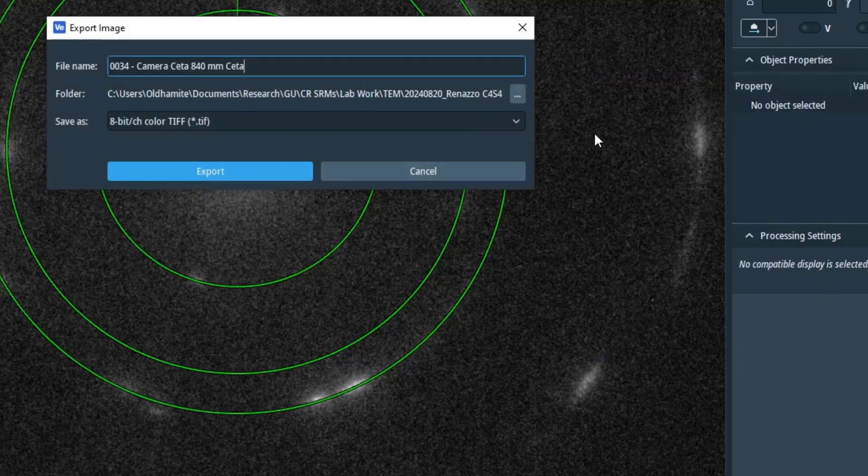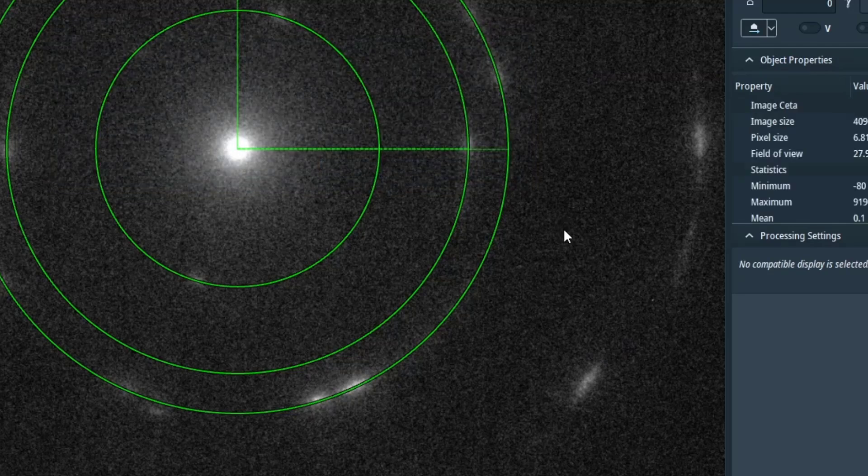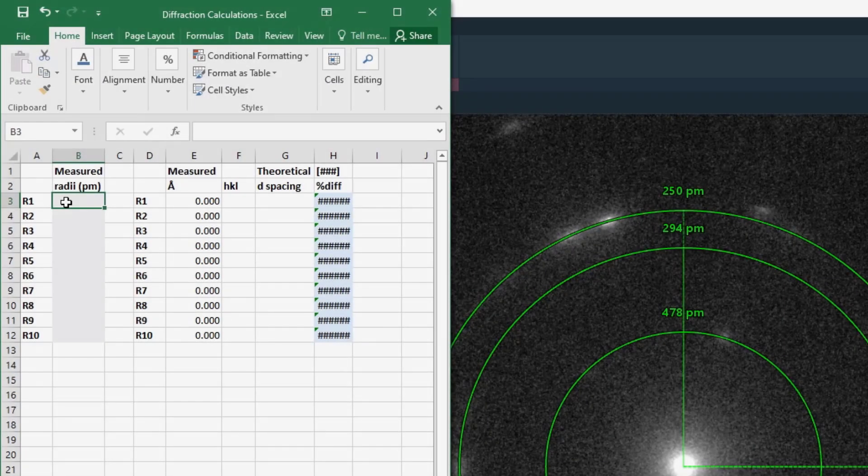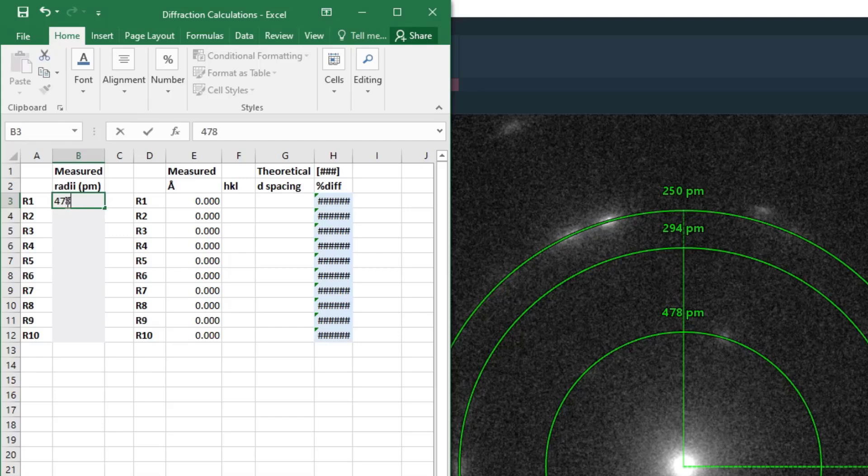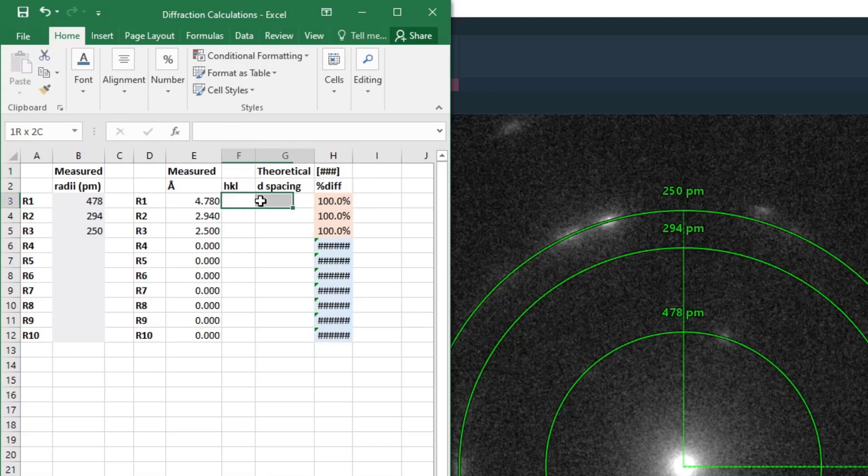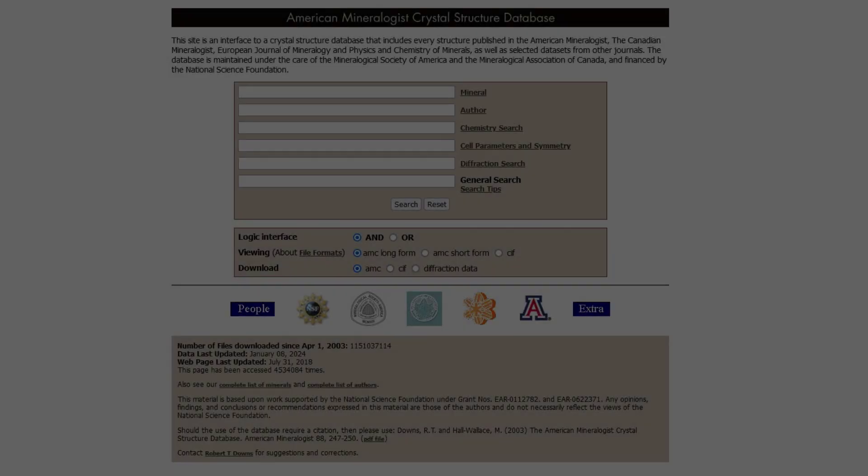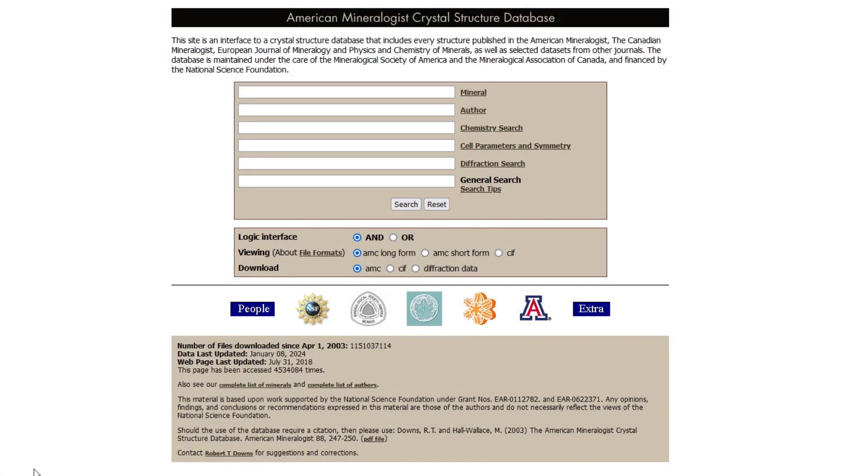You can do that by right-clicking and say export, but we're going to now compare our measurements to literature values. So I have this spreadsheet that I use for that. It auto-calculates the D-spacings in Angstrom since that's what's reported in literature, and then I'm going to use literature values for different mineral phases and see what the percent differences are between what I measure and what theory says.